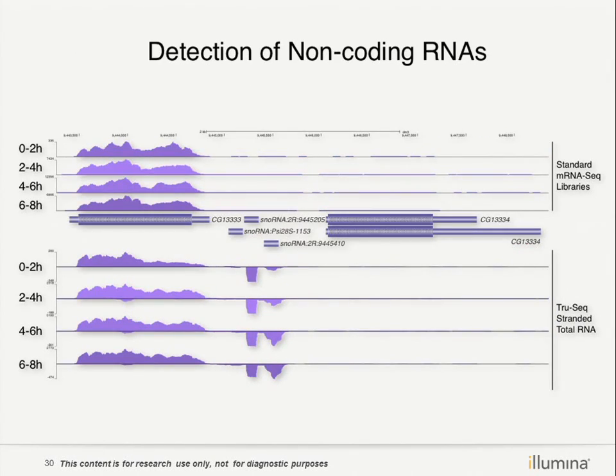And the second advantage: with the messenger RNA method, we only find some exons. We only find some coding regions of the RNA. But here, because we use total RNA, it just removes the ribosomal RNA but keeps the other parts. So not just the coding region, but also some non-coding regions. So using the total RNA library preparation will give us more information here. Like we can see the upregulation of this expression across the 4 stages. By using the mRNA kit, we cannot find this information.